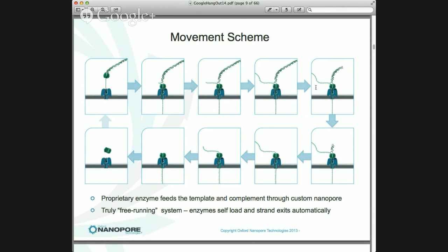And only certain proteins can do this. We did an enormous search for the right proteins. Now in our case, we don't have to do this, but we do. We put a hairpin on the end of the DNA, and then the system will process around the other strand, and we can get both strands of the DNA sequenced and readable.